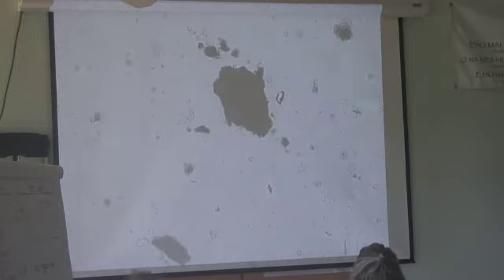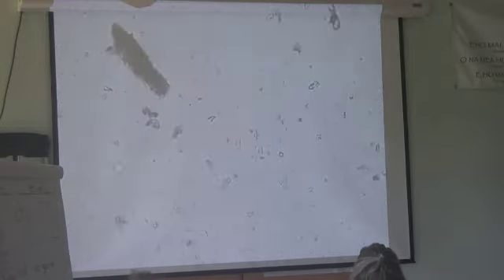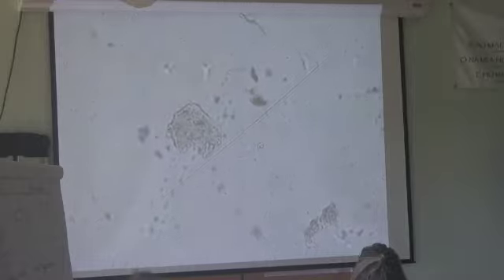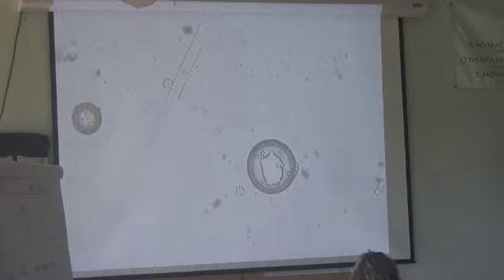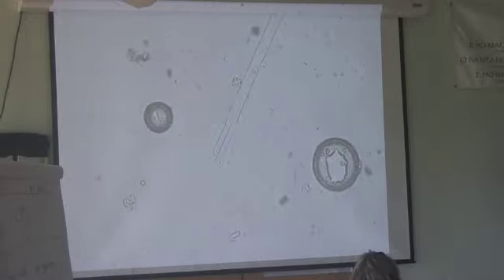So we got two nematodes in the sample. Do we have a nematode count per sample? Her slide that you prepared. And remember, that's just two drops that are on here. Okay. So it's the number of nematodes in two drops. And so when we get to the spreadsheet, we'll go through that.